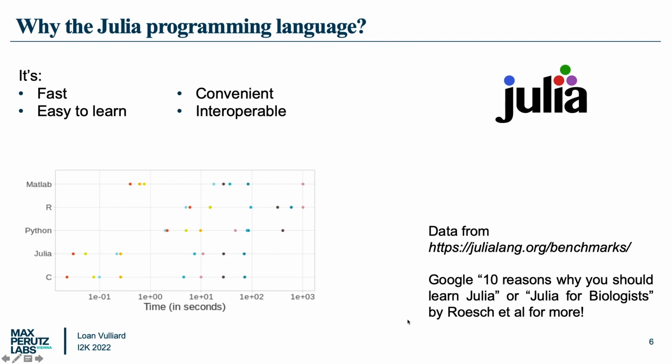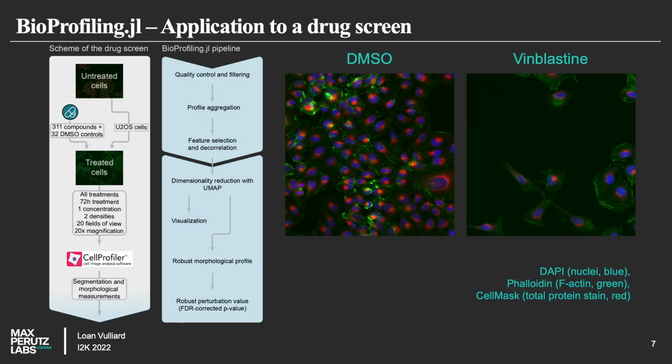Now I will illustrate what BioProfiling.jl can do. And for that, we conducted a drug screen where we tested a few hundred different drugs on U2OS cells.